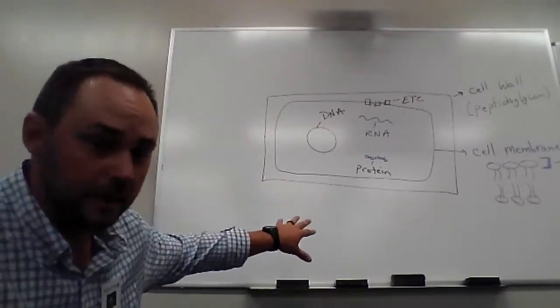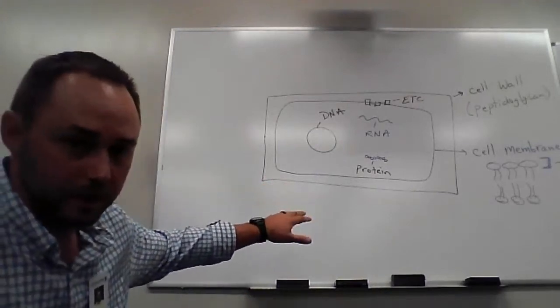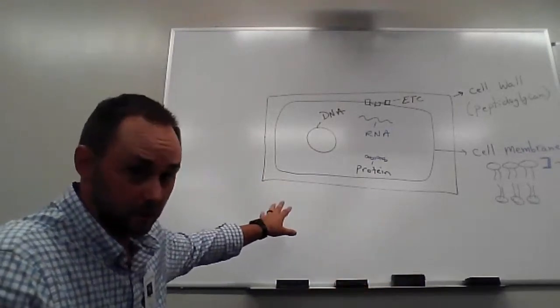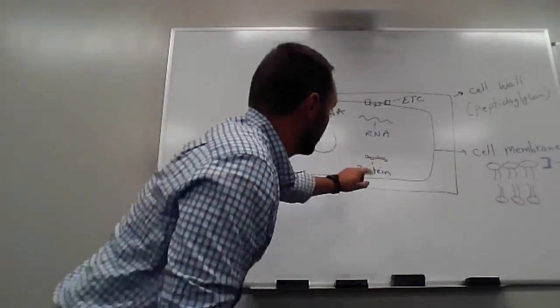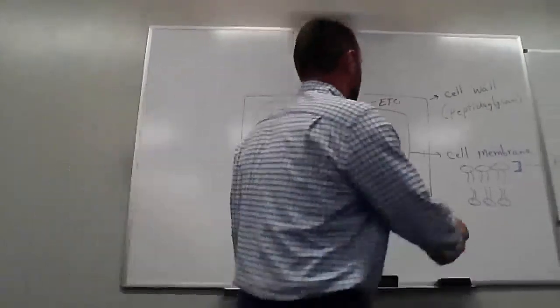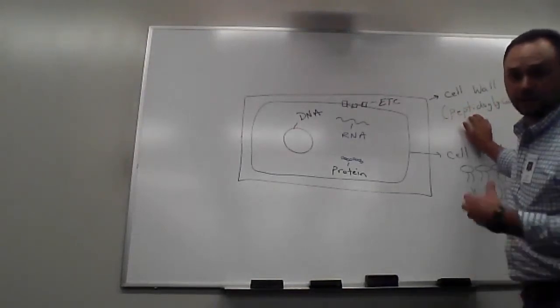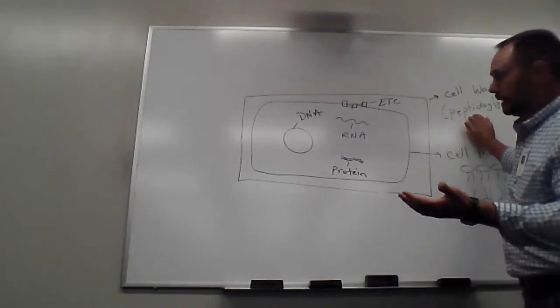but just to build off of what he was saying, with our bacterial cells, some of the features that we really want to pay attention to, that you'll learn more about as we progress through staining, is that most bacteria, especially the ones we use in our lab, contain a cell wall, which is the black rectangle I've drawn here on the board. That cell wall contains a component known as peptidoglycan. That's a key component in aiding the identification of bacteria.